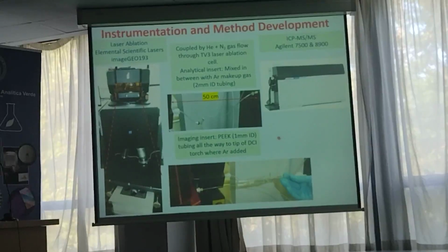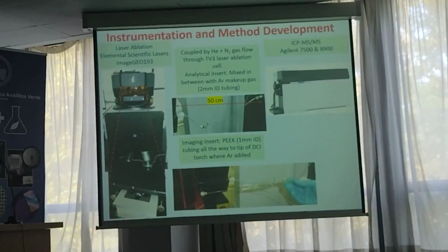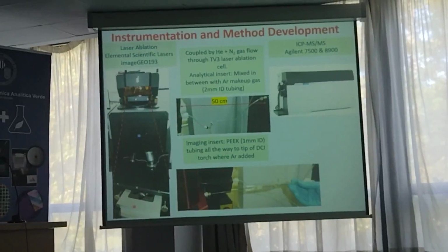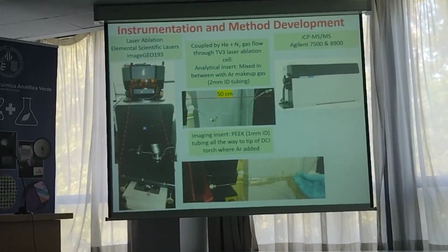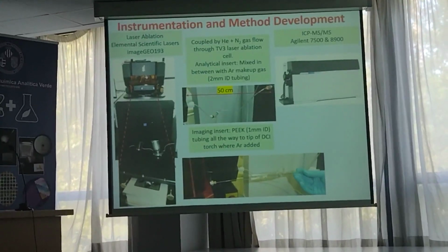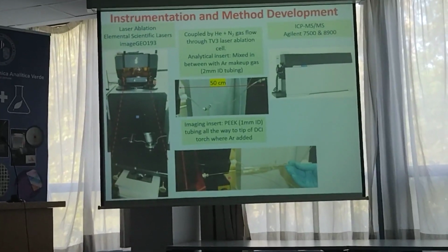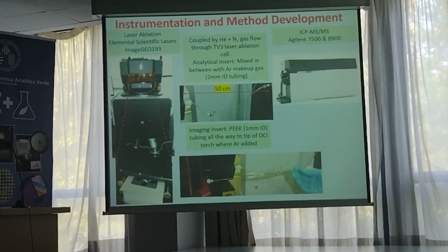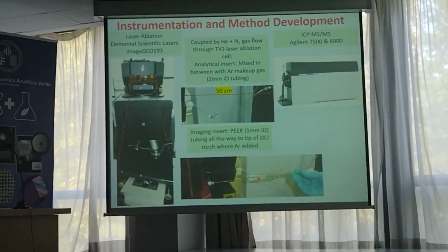And actually we can see here for Rio, on the left, this is the head of the laser, and down here, this is the sample tray, so your sample would go in here and goes in the drawer. You fire the laser through one of these lenses, and over here in the center we have some tubing that takes it into the mass spectrometer on the right. In fact, if we are doing very, very small samples, or we are mapping samples, you actually can have a special torch for the ICP-MS. But if anybody is really interested in that side of things, talk to me afterwards.